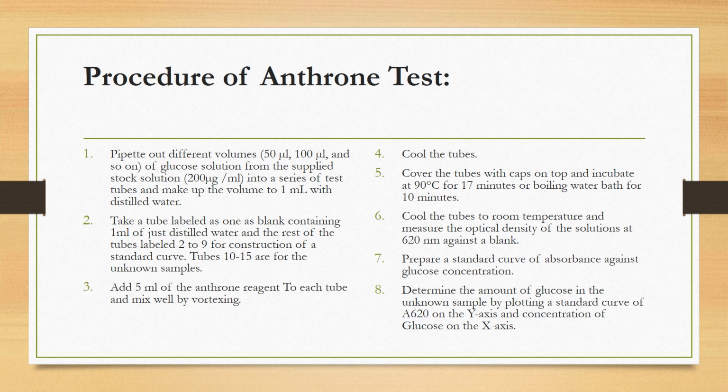Take a tube labeled as blank. This blank tube contains just 1 ml of distilled water. There is no glucose and no carbohydrate in this tube.